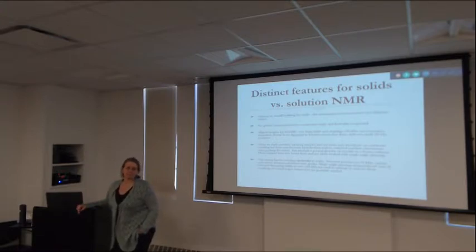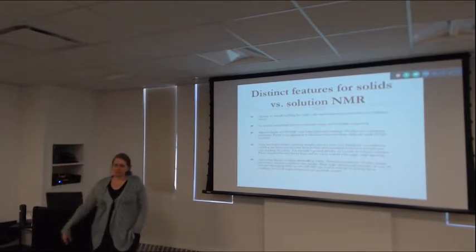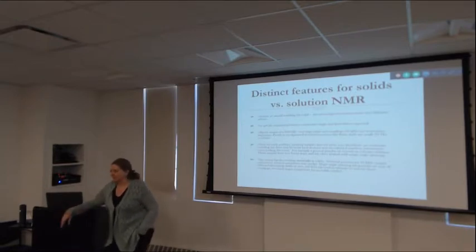Is 100 kilohertz enough? So these are ongoing experiments in leading labs around the world, thinking about just how fast you have to spin in order to remove a network of couplings like that. And then dipolar couplings could also be removed, of course, by decoupling pulses. Does that have to be 200 kilohertz? How big does that have to be? And for the most part, we live in a time where it's almost in reach experimentally for most of us. We're not quite getting rid of those couplings.